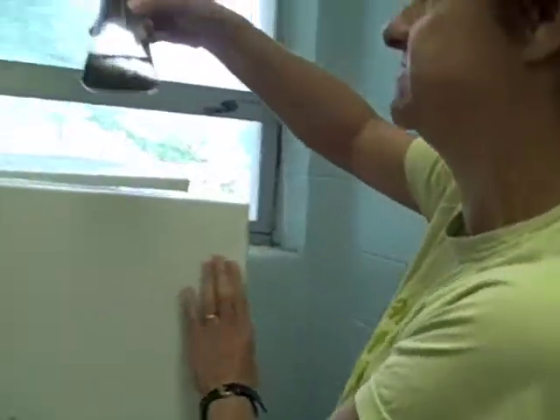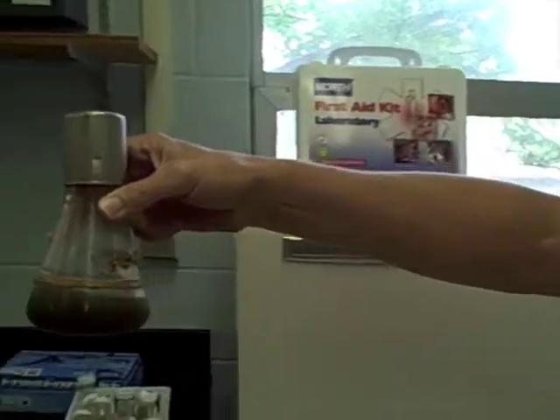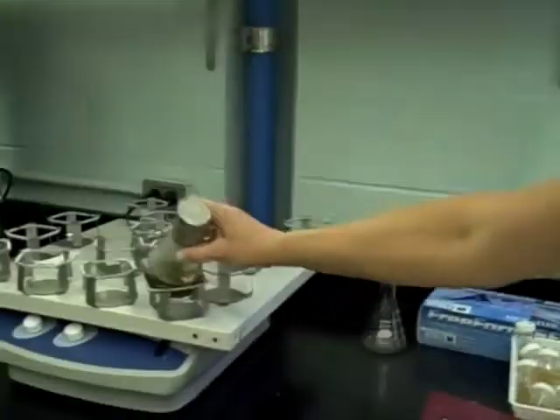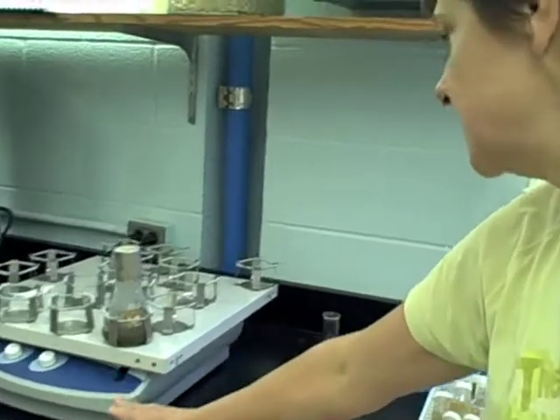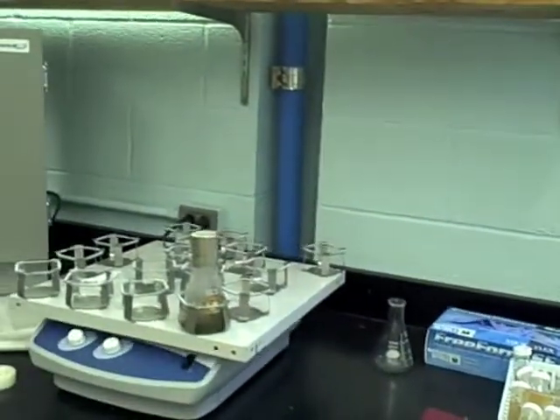These look pretty ugly — this is Metarhizium in liquid culture. It's grown on a shaker like this for just two or three days. And once the fungus has grown in that liquid medium, it's ready to be transferred onto a solid substrate, and we use cereal substrates such as rice or barley.